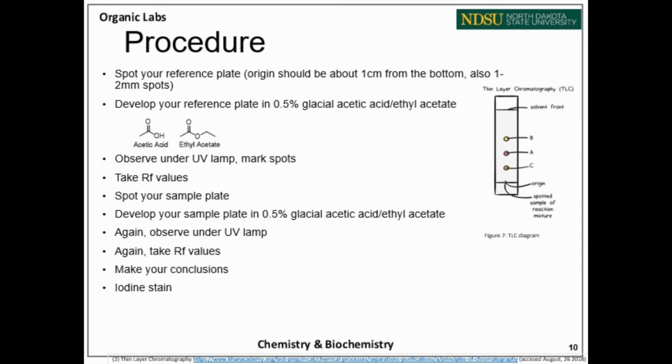You're going to want to illustrate your TLC slide in your lab books with all the RF values. Next, you're going to spot your sample plate. The sample plate will be developed the same way as the reference plate. Once again, you're going to observe it under the UV lamp and then take the RF values just like the reference plate, and you're going to make some final conclusions about what is what using your two plates.